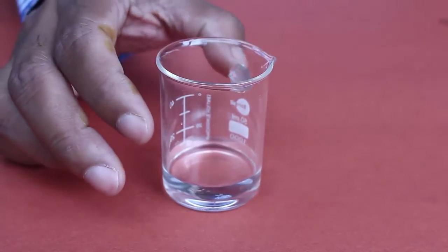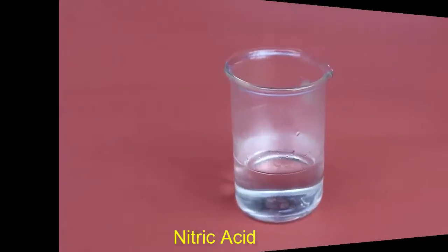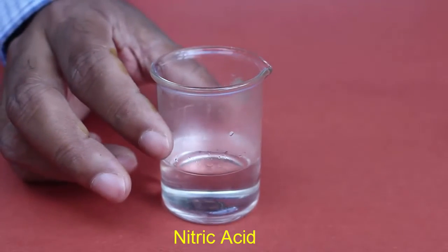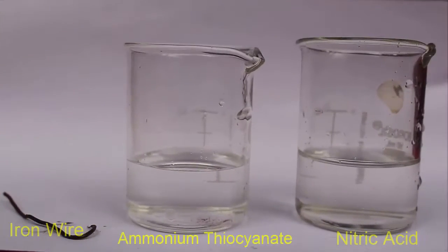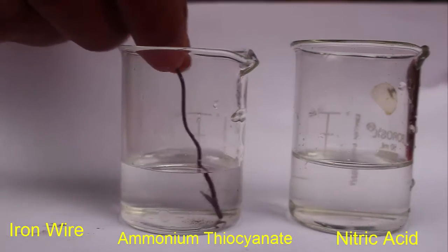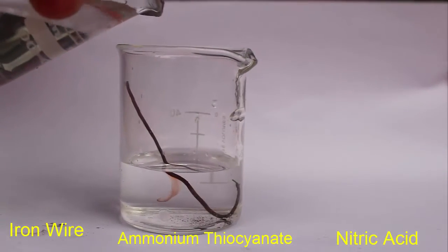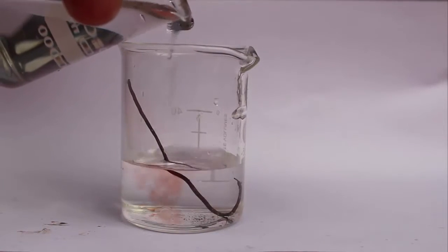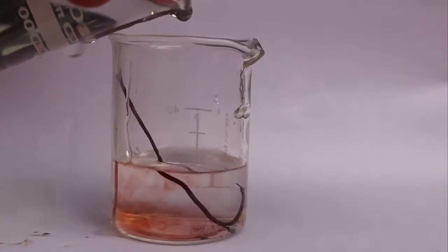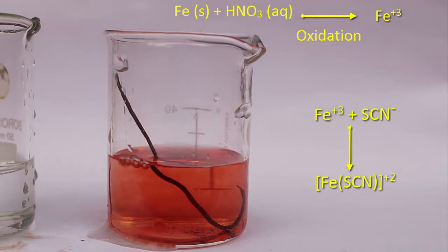Now this saturated solution of ammonium thiocyanate is ready for our reaction. We are taking a little bit of nitric acid, and this iron wire is dipped into the ammonium thiocyanate solution. Slowly adding nitric acid to the solution — the blood-like color is coming out of the iron wire, which is why this reaction is called the bleeding of iron.